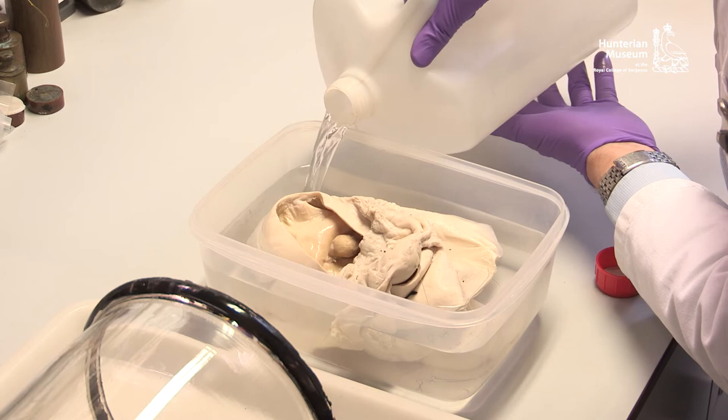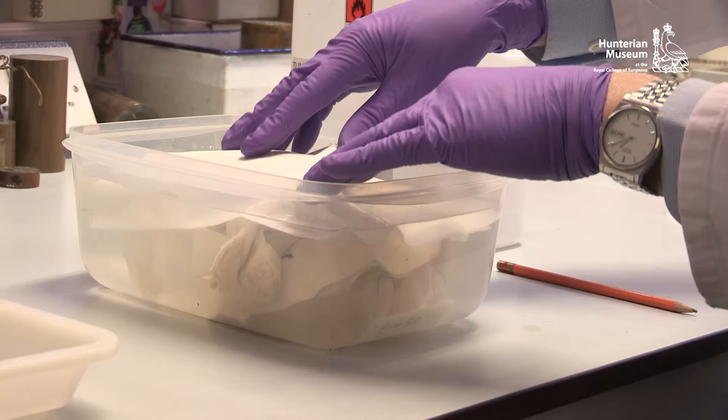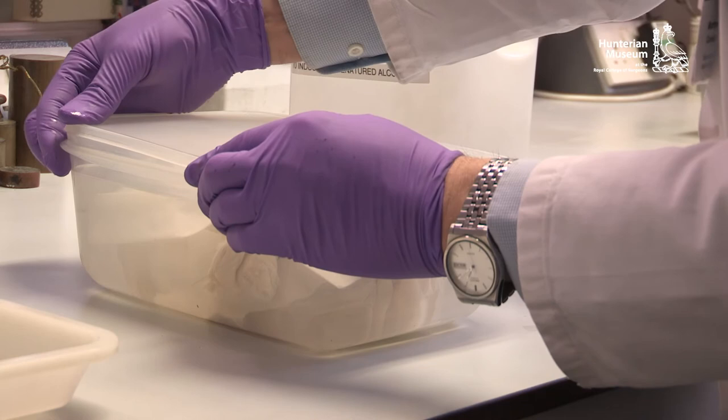Some specimens might float and protrude above the fluid level. A piece of absorbent tissue can be used to cover the specimen. It is essential that the storage container has a tight-fitting lid if the specimen is going to be stored for a long period.